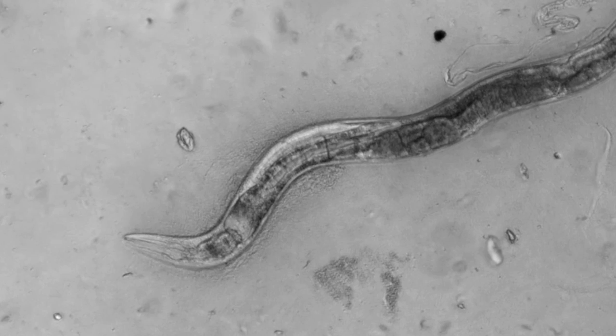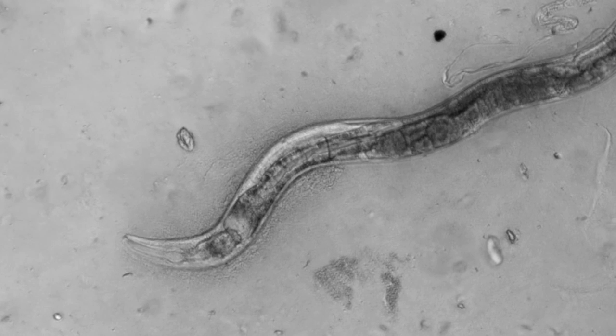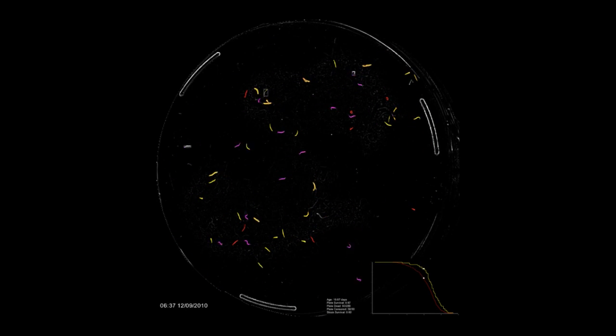Nematodes, like humans, spend the last period of their life not really being very mobile. You end up seeing these old worms who can really only move their head back and forth a little bit. So the task of the Lifespan Machine is to detect these subtle head movements, and then when they finally stop altogether, you can call the animal deceased.